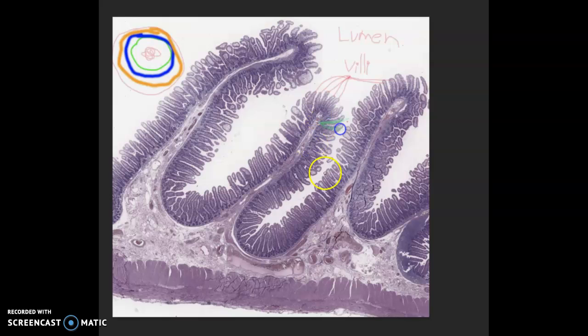This layer right here, so basically from here, why is this so opaque? It's from here to here is called the mucosal layer. So from here to here, that is all mucosal. So from here to here, that is all mucosal.